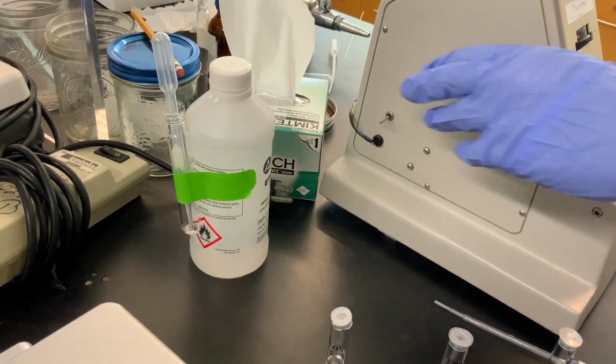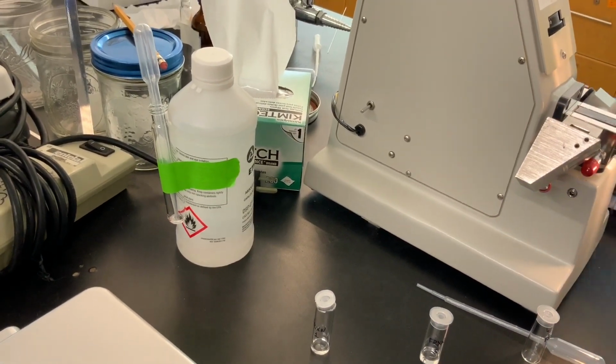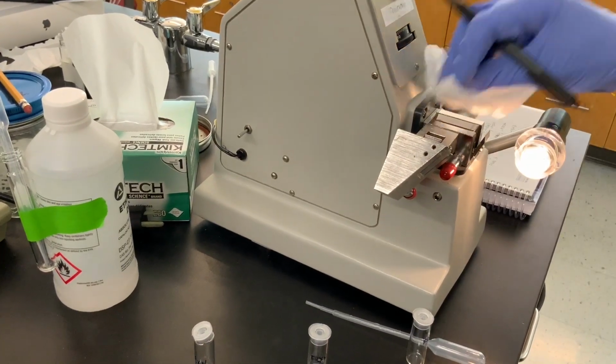So there we go. Now we got the right readings.